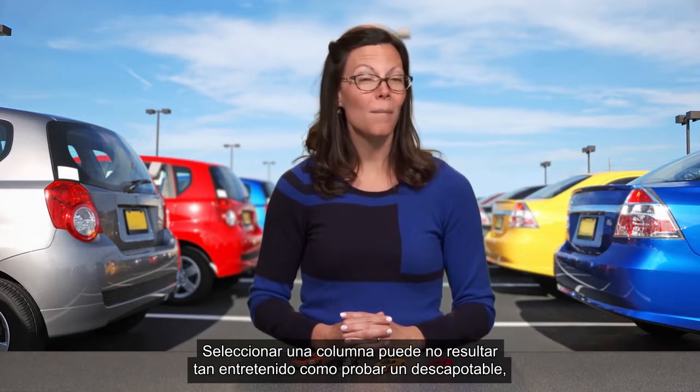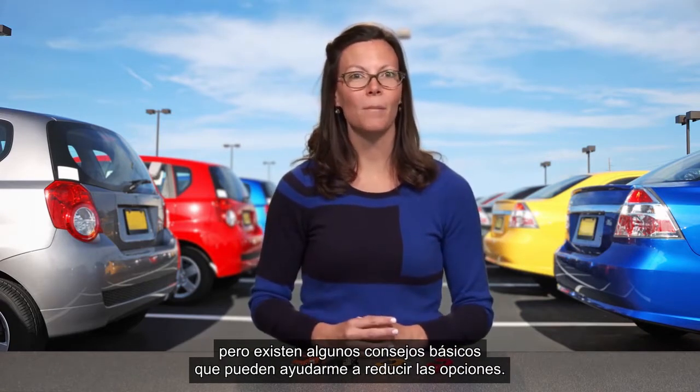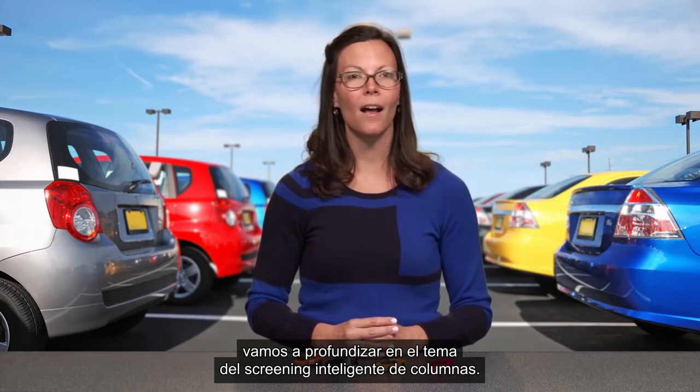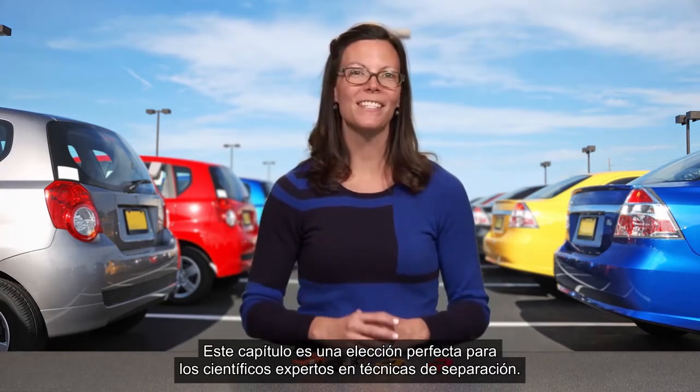Selecting a column may not be as fun as test driving a convertible, but there are some basic tips that can help me narrow down the choices. So in this episode of Behind the Science, let's dive into the topic of smart column screening. This episode will be a great choice for separation scientists.